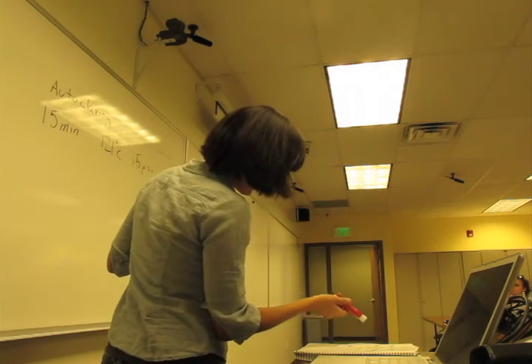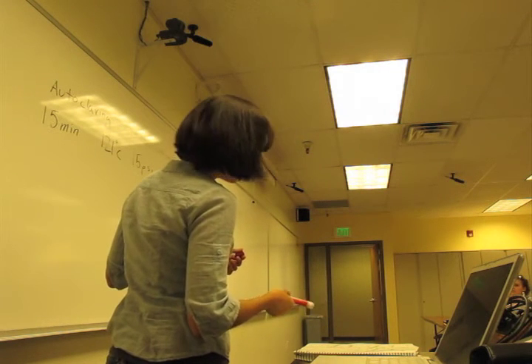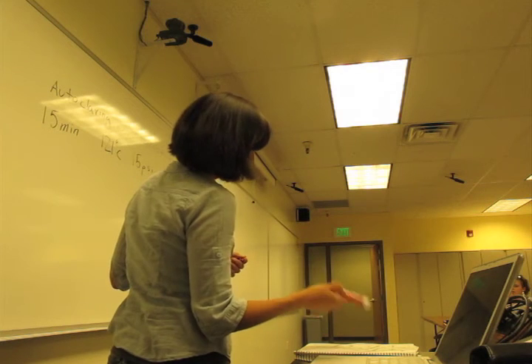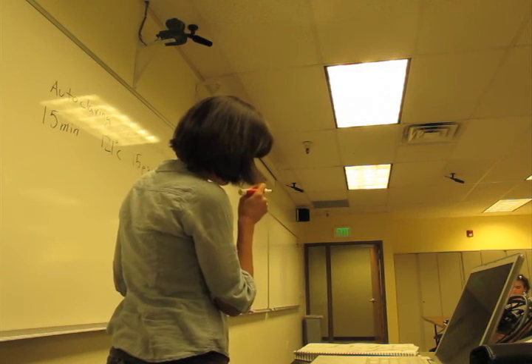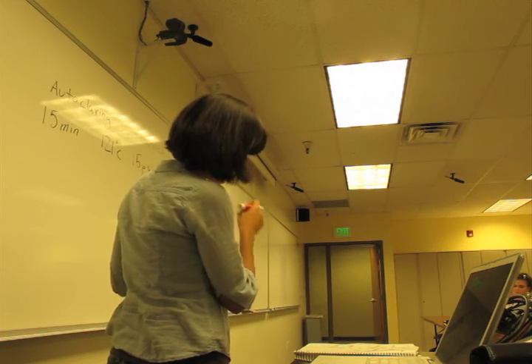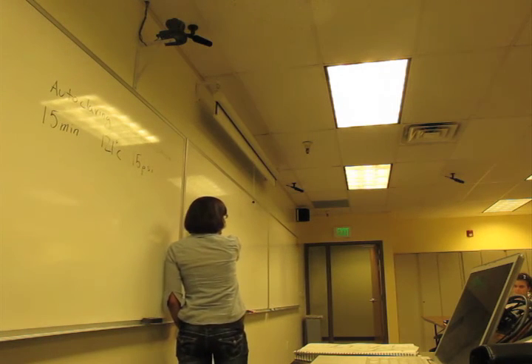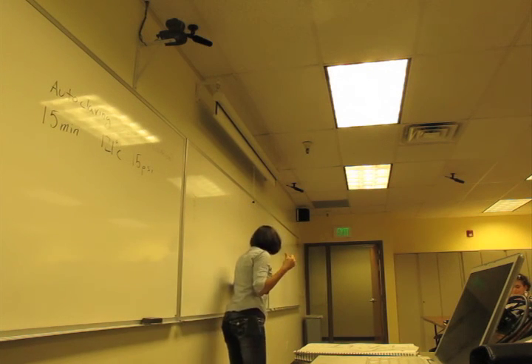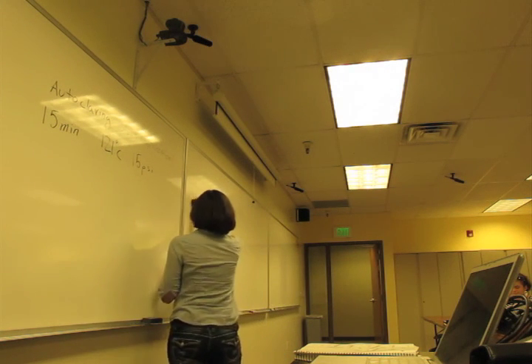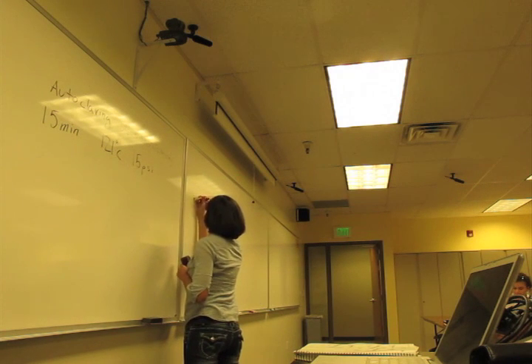Yeah, in the book it does say you wash it off after each step. But the only one you really need to know is the last one, the last water. So you do carbol fuchsin, acid alcohol, methylene blue, water. And I don't think you need to know heat because we didn't even do heat in the lab. In the lecture you might need to know the heat step, but as far as the lab goes, I don't think you need to know that. So, acid alcohol.